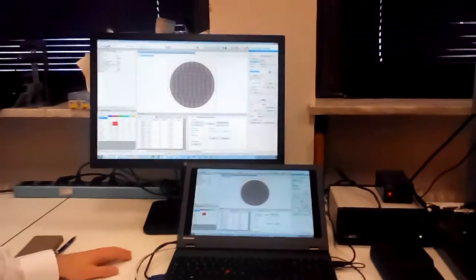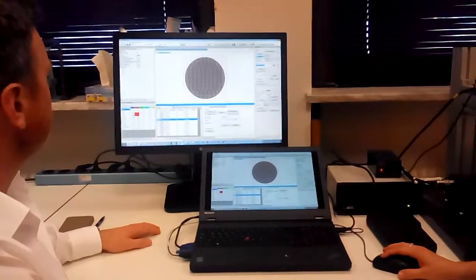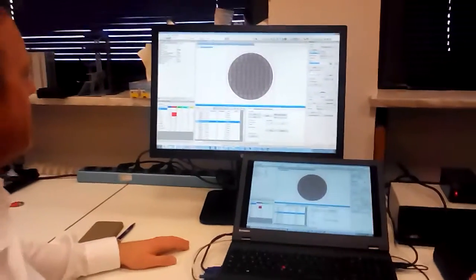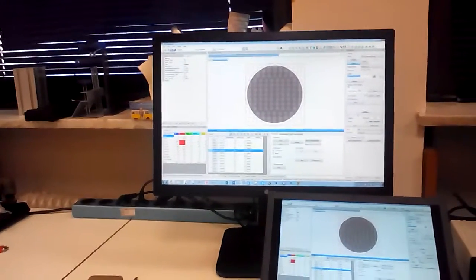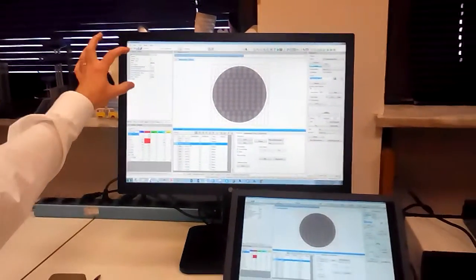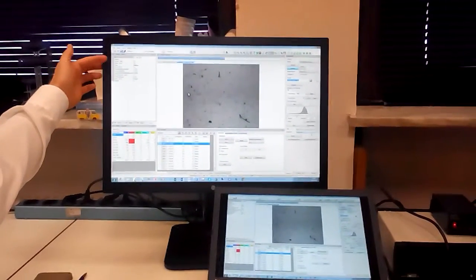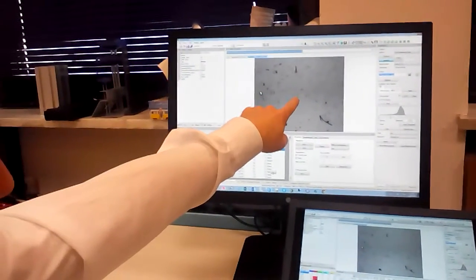Okay, and let's have a look at this window above. This window shows you more features, more details on the particles which we can select in the table. So whatever's highlighted here, you get this detailed view up here. Just for the video, we have the full length. So we get a little highlighted box around the particle here.